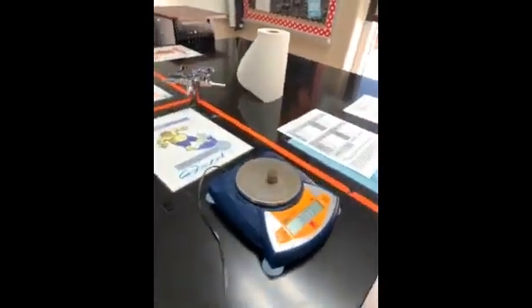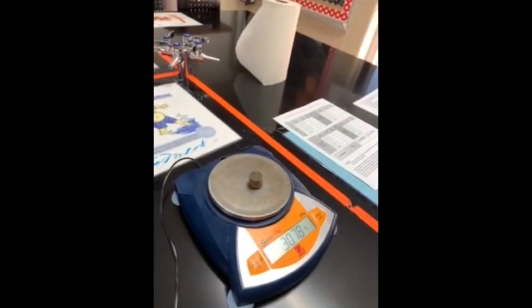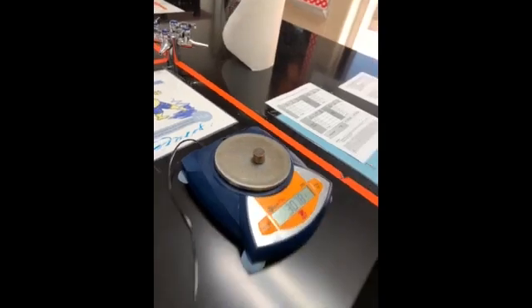And trial 4 of the pre-82 pennies. And make sure you get your mass down. We want to give it a chance to make sure it's got the measurement down. All right.